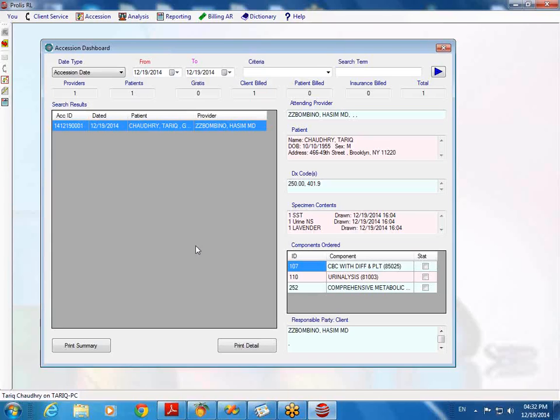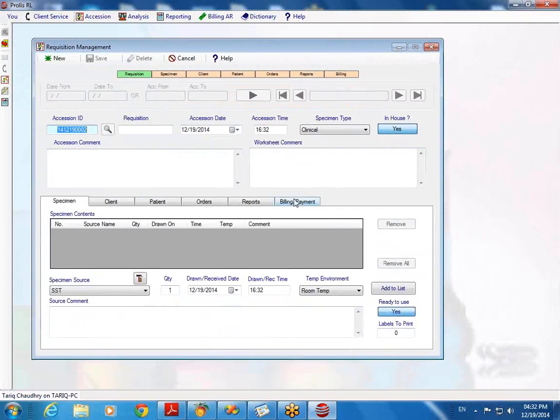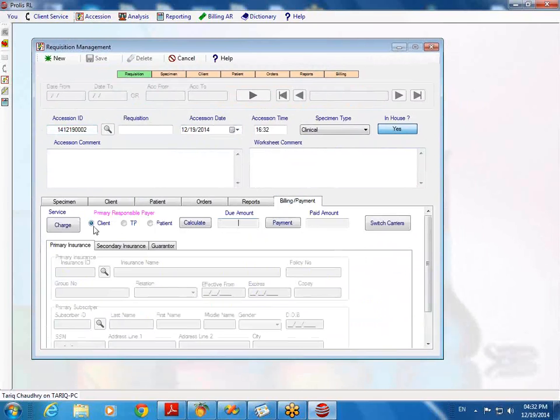And I'm just curious, I see that you have billing in there. What kind of capability does that have? We offer 3 kinds of billing, ma'am. The first kind is, I'll show you. We provide you client billing.